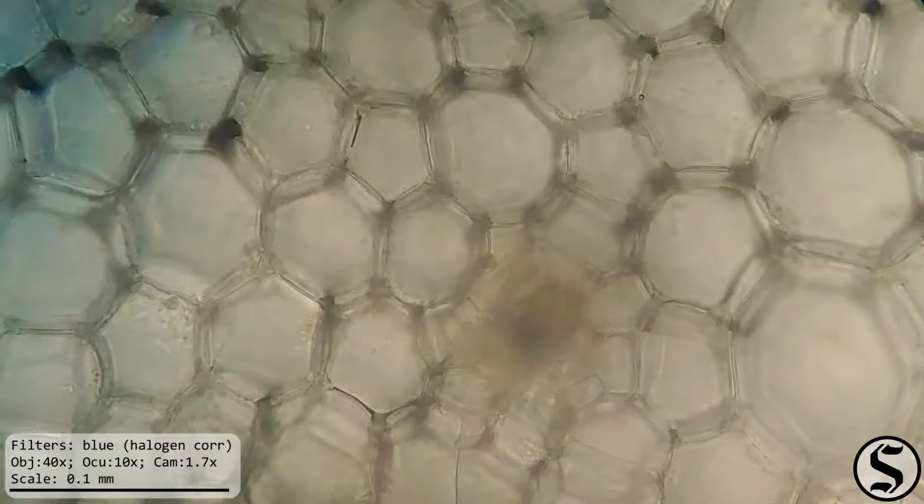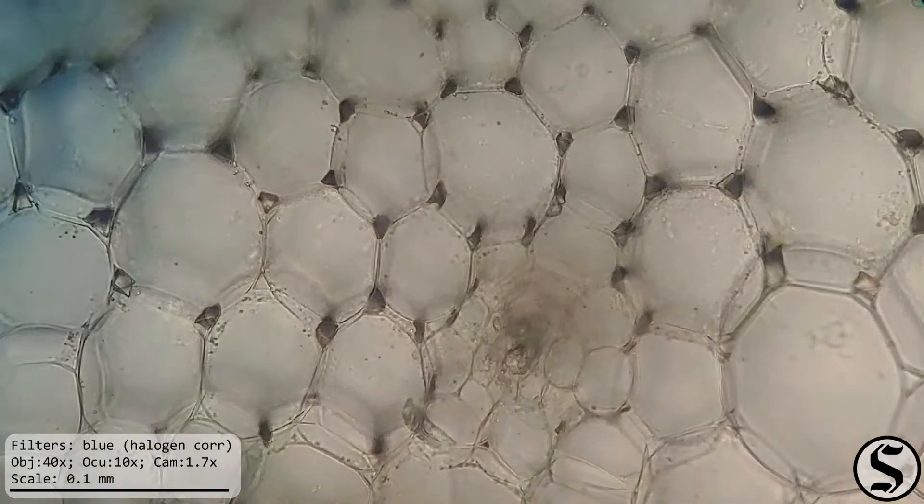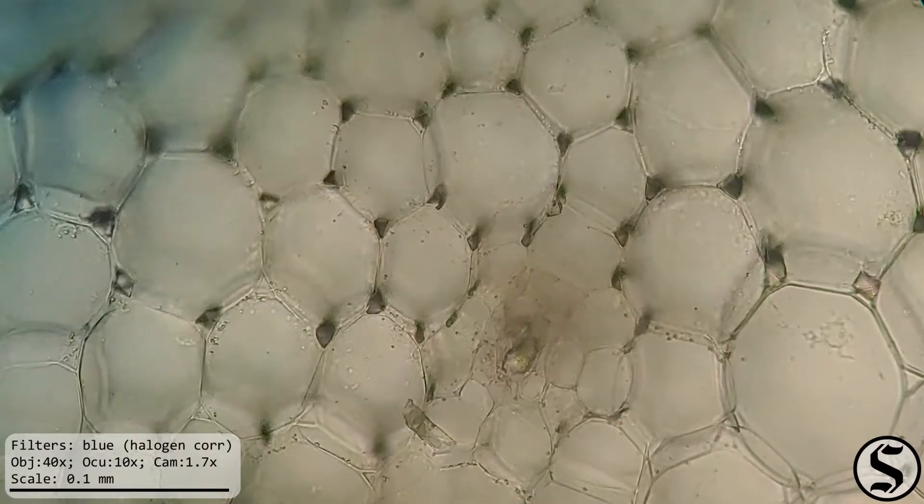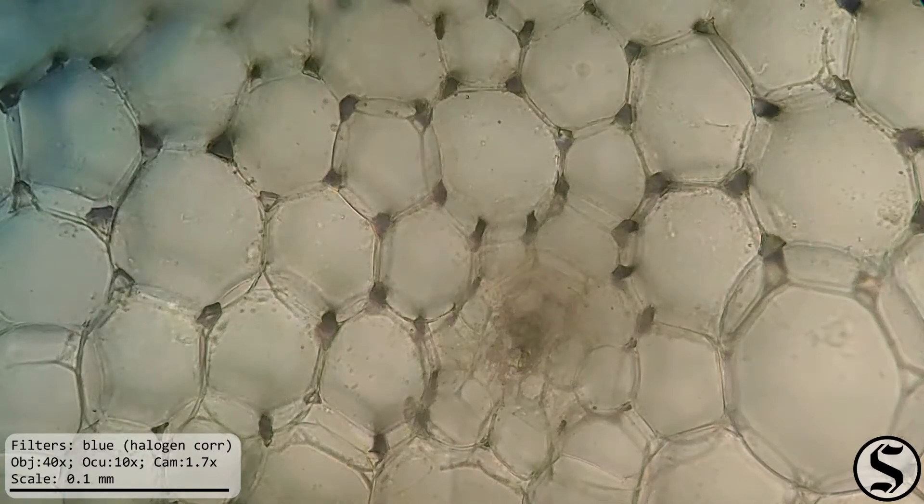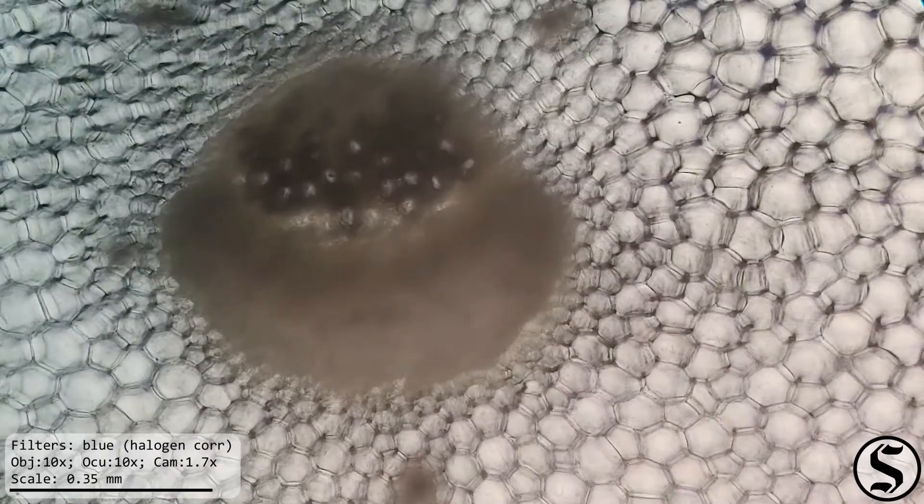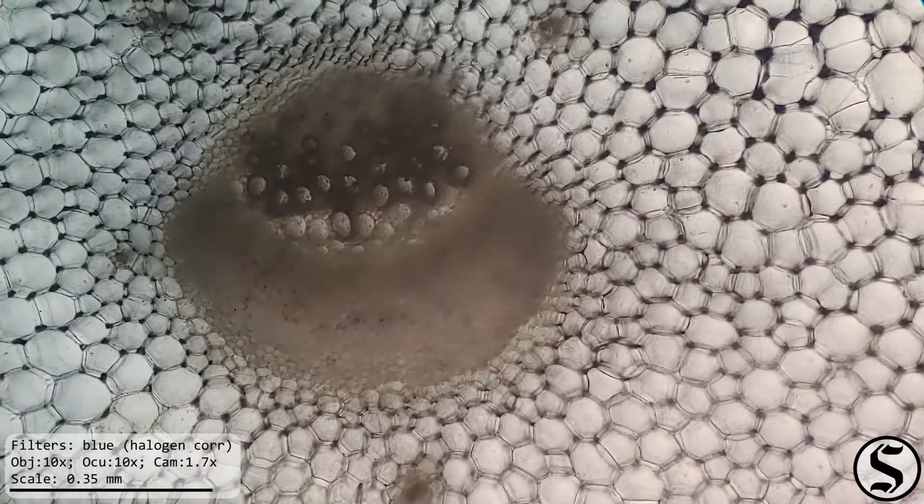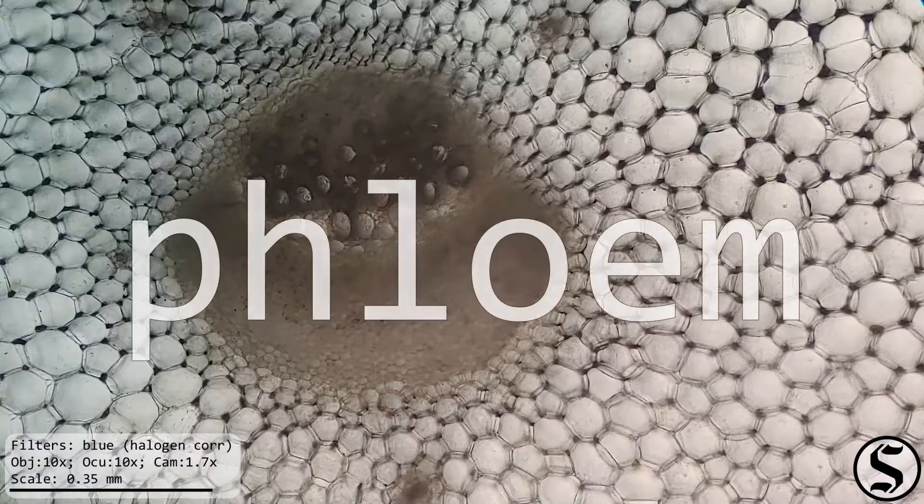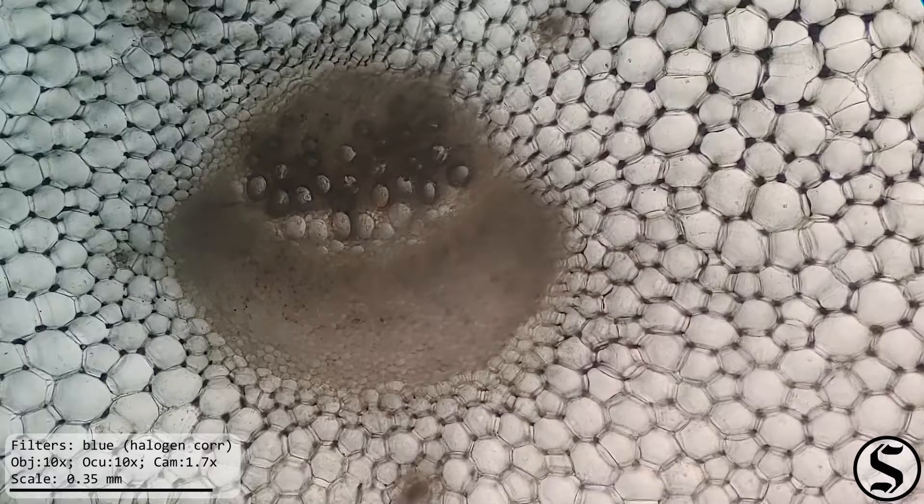And here in the parenchyma I think that's one of those tracheids. And then the part of the plant with the most going on I think we have here in this outer region the phloem that comes from the Greek word for tree bark and that's what carries sugar down from the leaves to the rest of the plant.